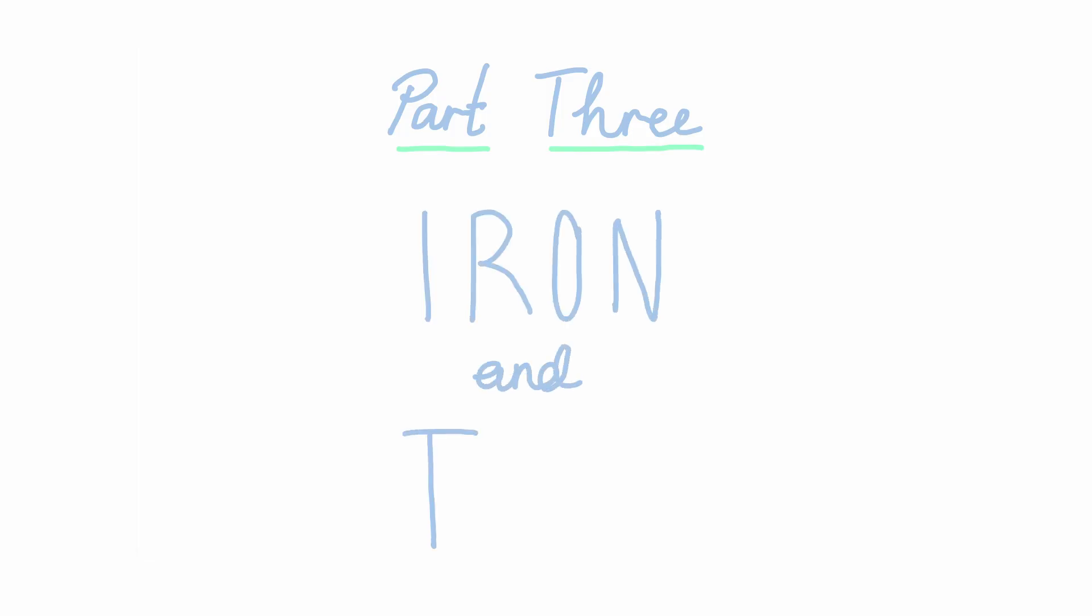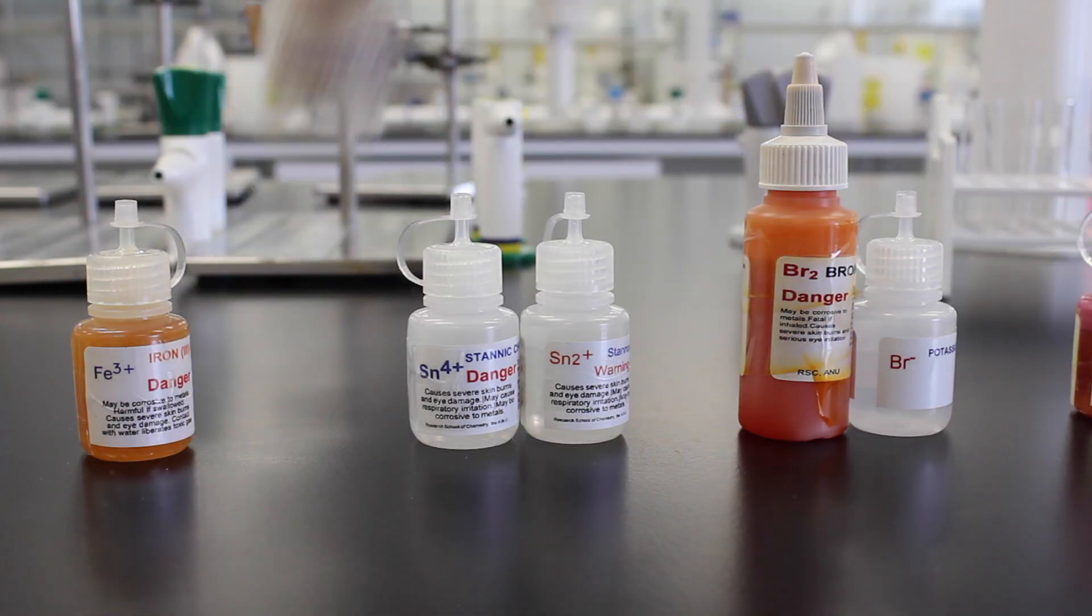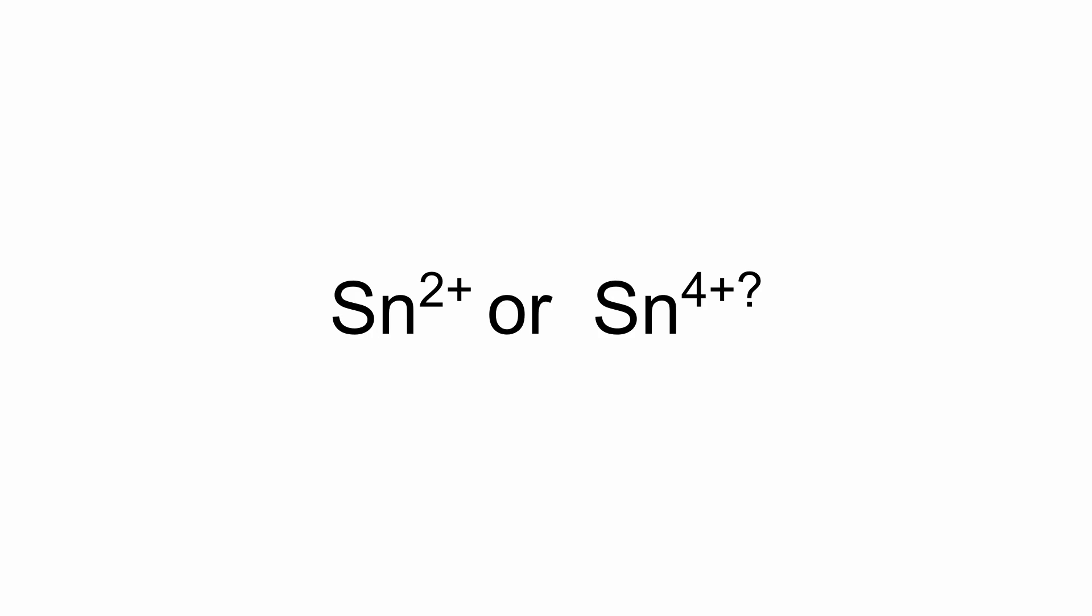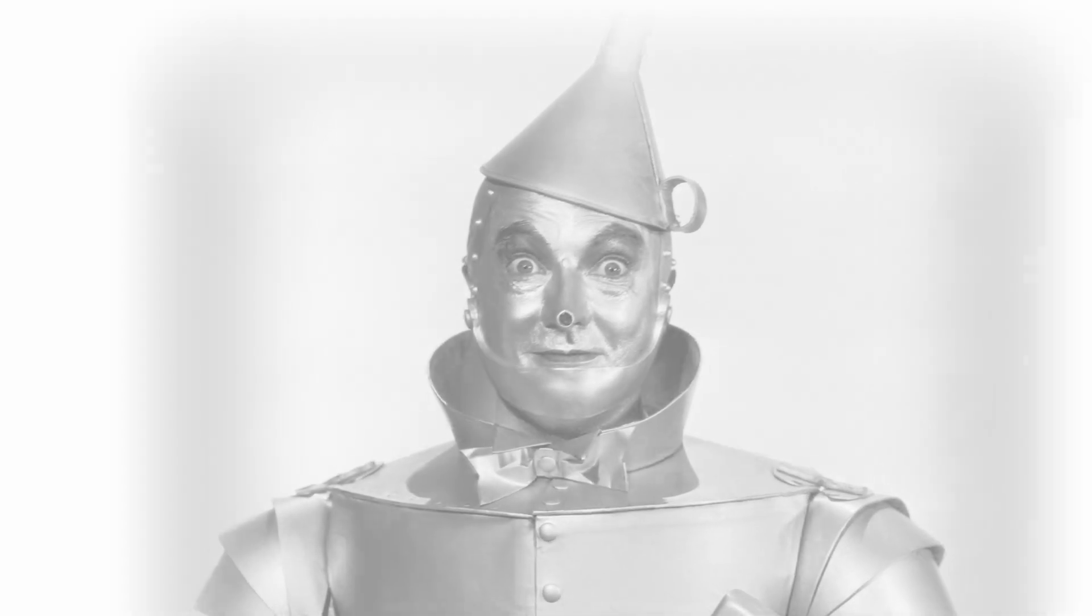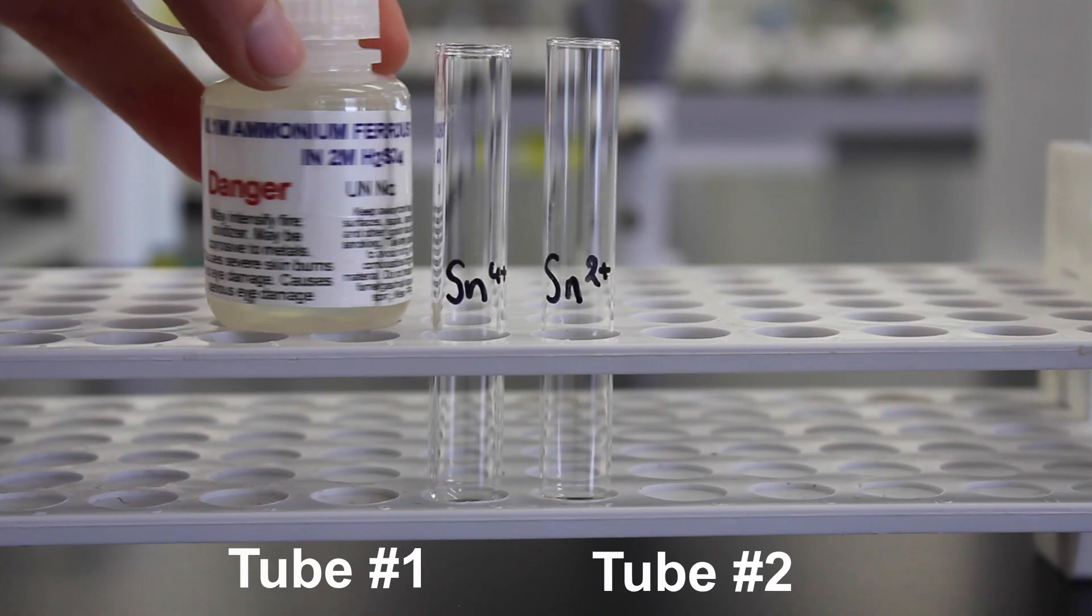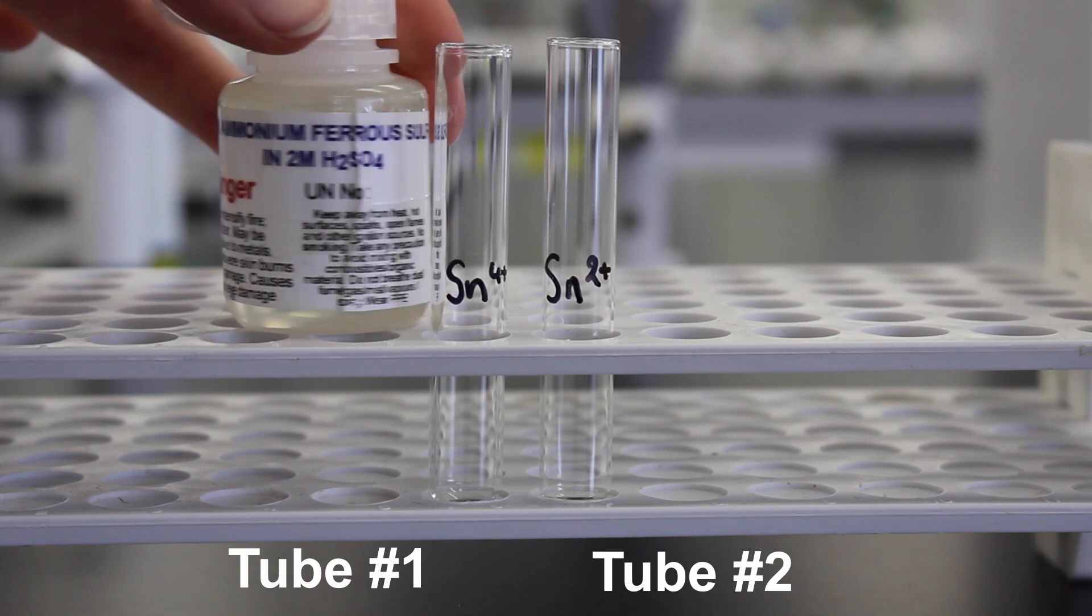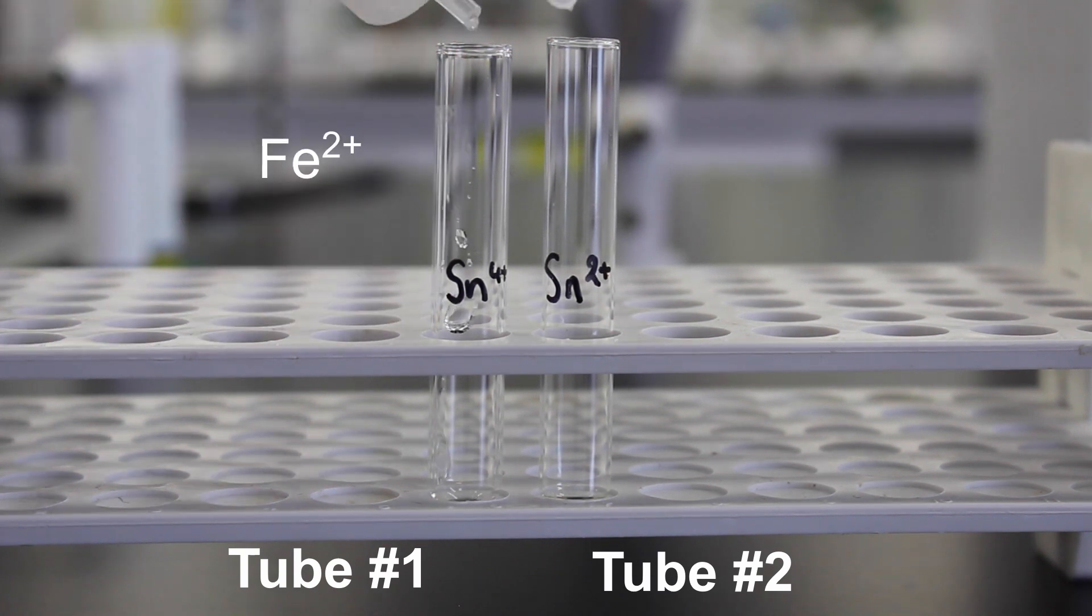Now that we've investigated the relationship between iron and bromine couples, we will now investigate the relationship between iron and tin. Our first experiment will involve iron 2+. Have a look at your notes and think about which tin species would be appropriate. That's right, tin 4+, which means that we will also be comparing iron 3+ and tin 2+.